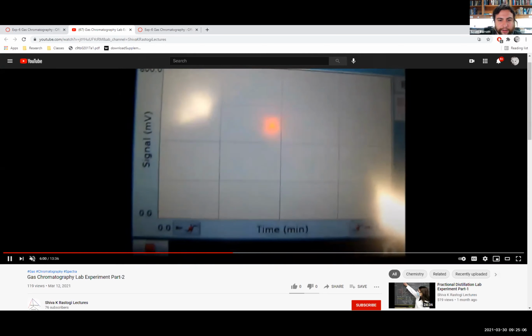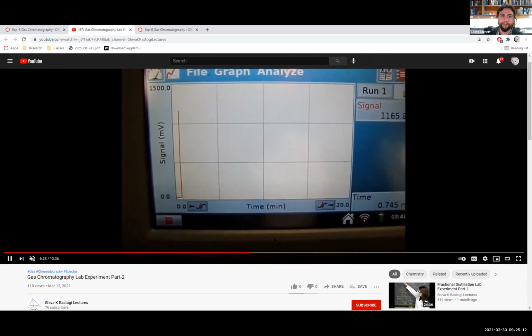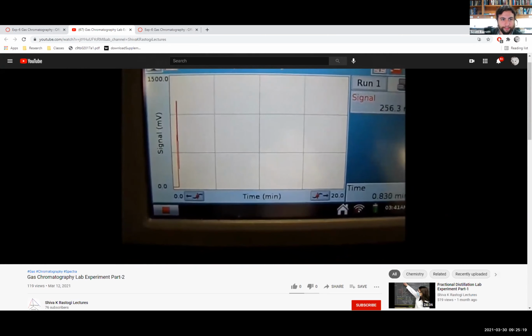So this is another point where I'm going to skip ahead because it takes a little time for us to run this experiment. So our first peak is noted over on this video at 6 minutes and 30 seconds. So I'll give this a second to see, boom. Now it just shoots up and you get your first peak in your ketone mixture, a very sharp peak, and now it's going to fall down.